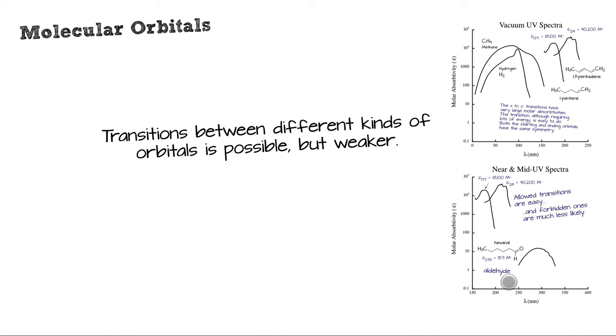And this is usually what you're looking at. You're looking at the UV spectrum of DNA, things like that occur around 250, 260, 270. It's these n to pi star transitions that you're really looking at. And then of course there's that shoulder. When you get a little lower there around 230, it just rockets straight up toward the ceiling. That's of course where you're starting to get the double bonds in. So this is a very useful place to look for structural information about your electronic system. So, big difference in absorption.